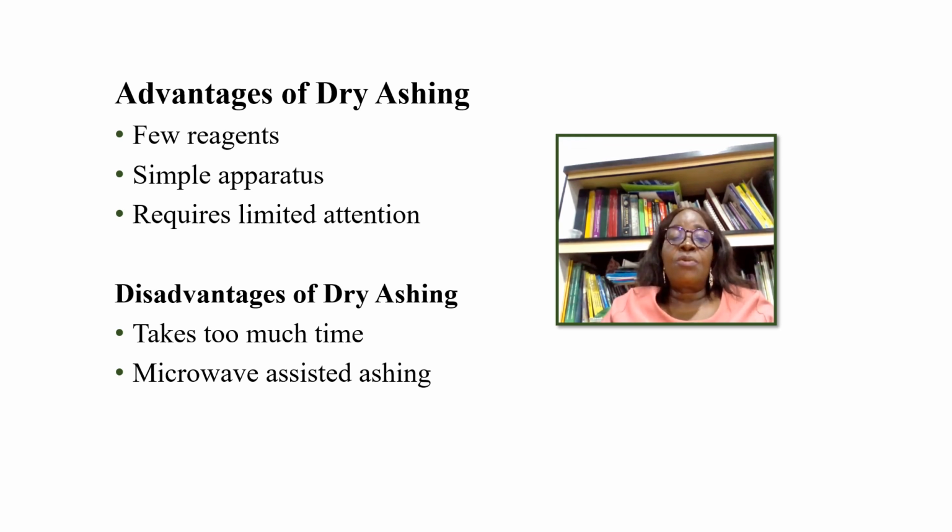The advantages of dry ashing are that few reagents and simple apparatus are needed, and it requires limited attention. You can dry ash and still be busy doing other things. But the disadvantage is that it takes too much time. To overcome this challenge, microwave assisted ashing was introduced. This takes just a short time during that process.